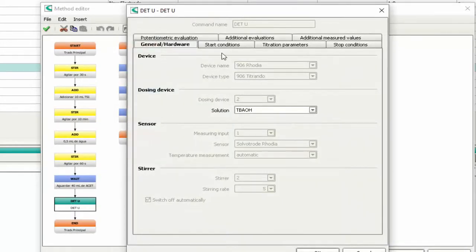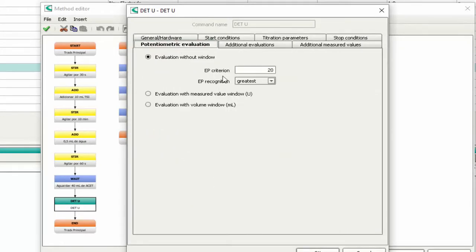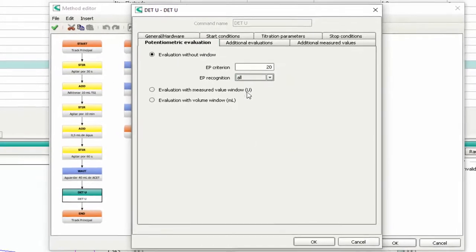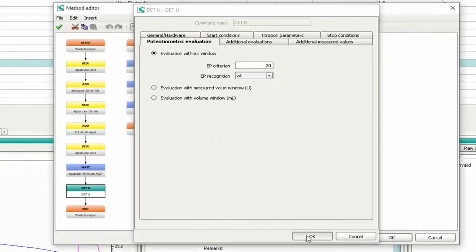Select the tab 'Potentiometric evaluation'. Change the EP recognition to 'All' and press OK.